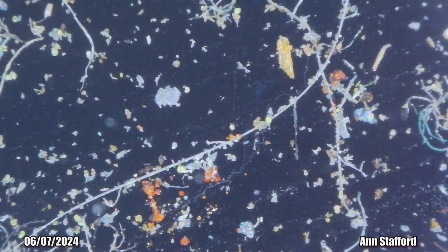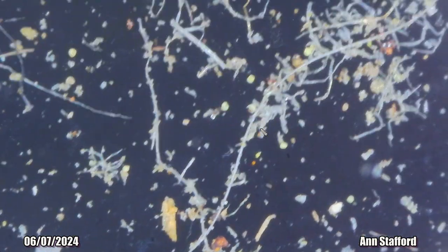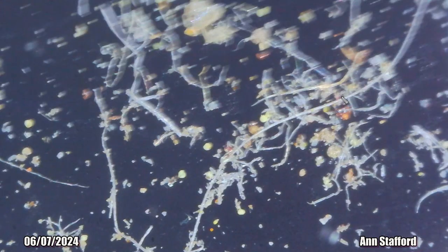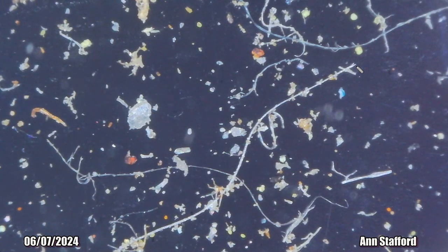Now this is interesting because this is like one long thread that has little buds growing off of it. It's what it looks like to me. It has these little bits growing off of it. Really don't know how to explain this. It could be one of, but this is so long that I don't really know how to. Yeah, I'm really not sure. It's very long. My goodness. See? Okay. And look, it ends in one of the V's. That's interesting.